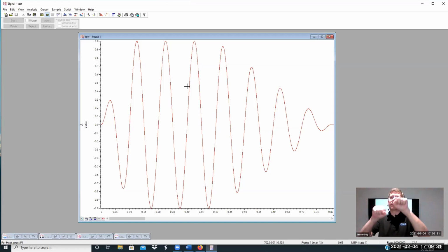And that means that we have less of a jump from input to output. So we don't have this high step to go through, which can cause problems with the filters as well. And that usually helps with stimulus artifact with TMS. But there are other methods as well. So Shiwen, please get in touch again and we'll talk about any particulars.